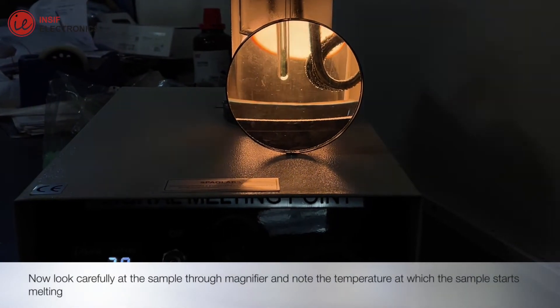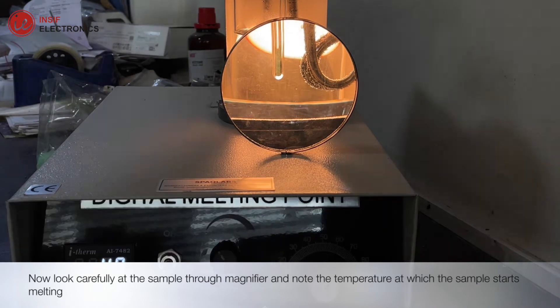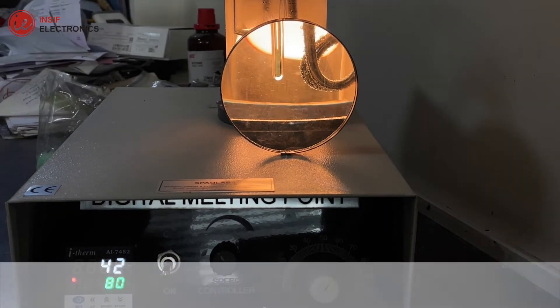Now look carefully at the sample through the magnifier and note the temperature at which the sample starts melting.